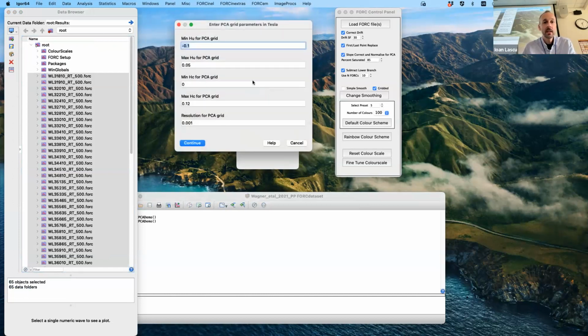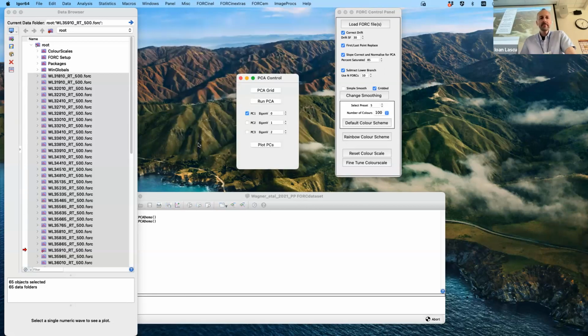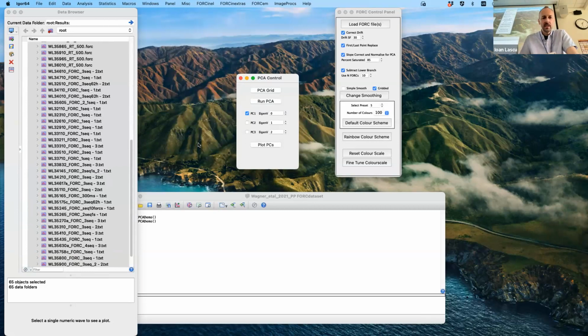PCA grid. He wants you to know that he feels vindicated. Yeah, I'm sure. He's actually controlling my hands. All right, so here's our grid again. Continue. Oh yeah, now it's going through all of them. You were right.